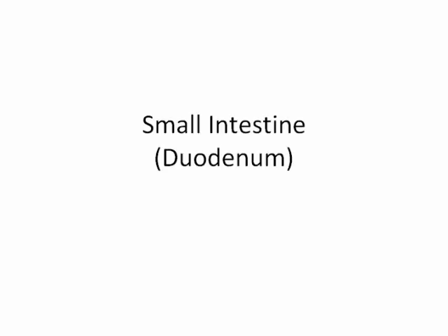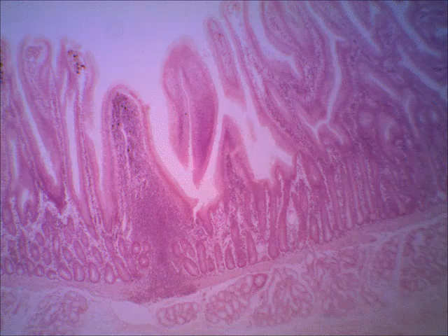The next few slides will be of the small intestine. The particular section of the small intestine that these slides are showing is the duodenum, which is the first part of the small intestine. So as it moves, we'll see it on, this is on scanning. Now, earlier, just a few minutes ago when we were talking about the stomach, I mentioned to you more than once that the surface of the mucosa in the stomach is rather uniform. The surface of the small intestine is not uniform.